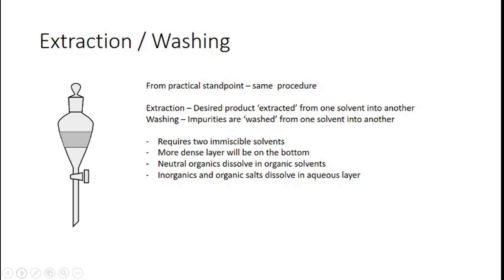They are immiscible. The more dense layer will be on the bottom. Usually, the organic layer will be on top, because most organic solvents are less dense than water, but there are exceptions. In particular, halogenated ones, but there are other exceptions, so you do need to know the densities of the organic layers. And typically water we can assume is going to be around 1 unless it is a fairly concentrated solution, in which case it could be greater.